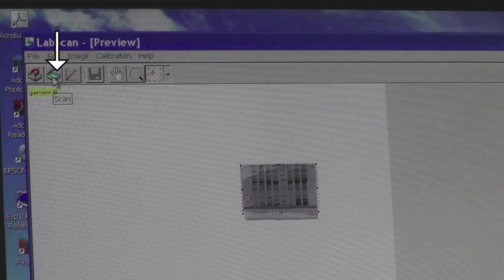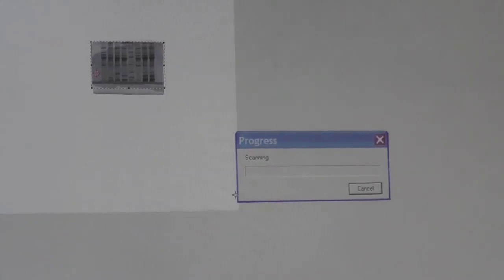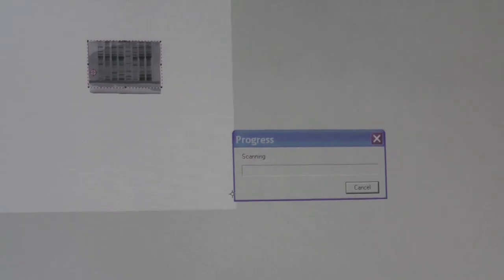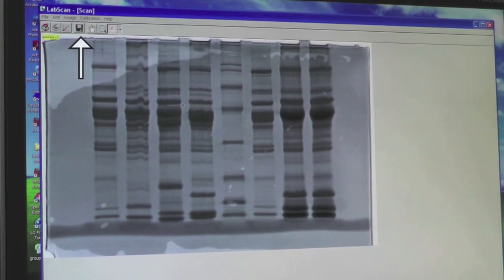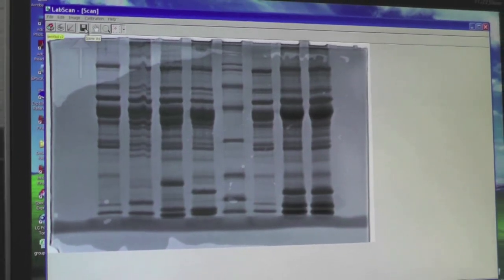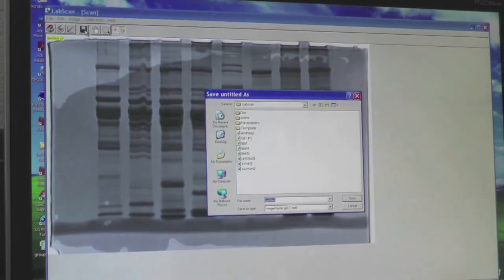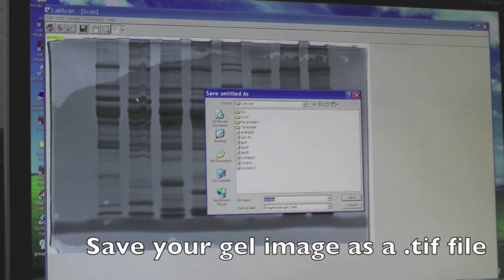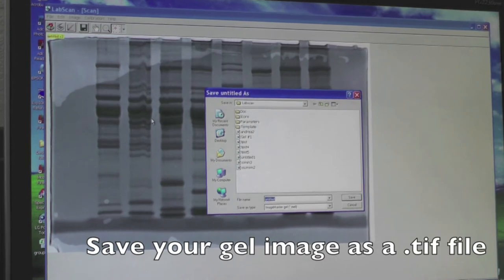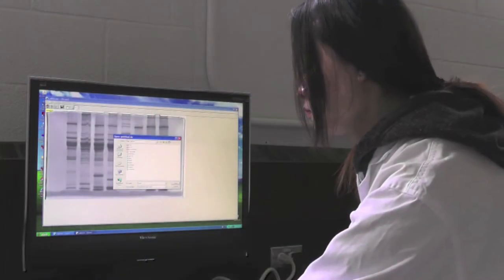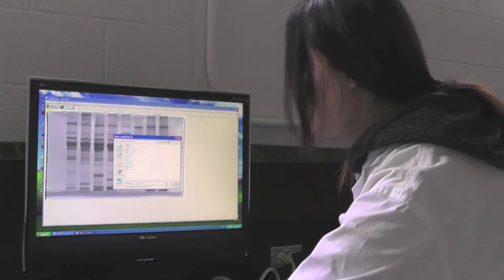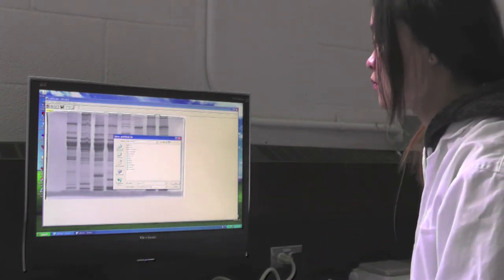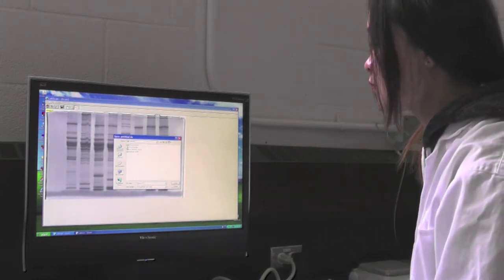Next, click on the scanner icon with no question mark. An enlarged image of your cropped gel will appear. Click on the floppy disk icon to save your gel image. Make sure to save it as a TIFF file. Name the picture with your group number along with SDS or IEF depending on the type of gel you used, and save your image in the designated folder.